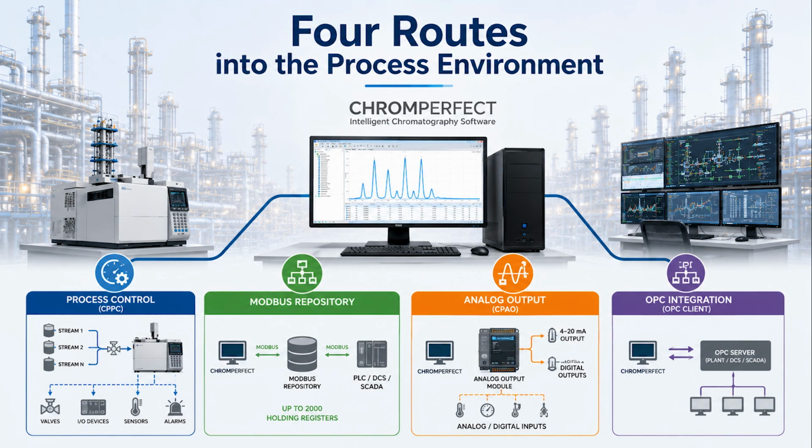CPPC controls and coordinates the analyzer workflow. The Modbus Repository stores and exchanges data with plant systems. The analog output module converts completed chromatographic results into physical, analog, or digital signals. OPC provides another software-based communication route into compatible control systems.